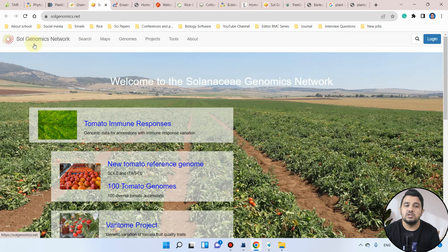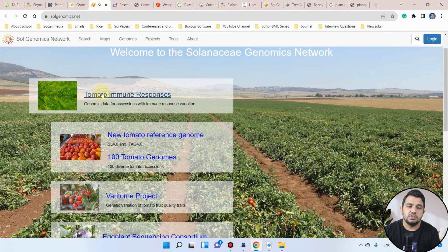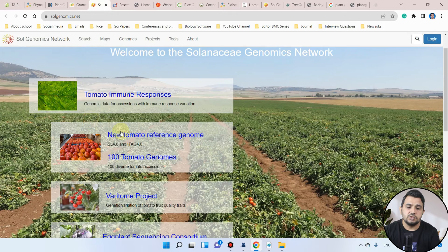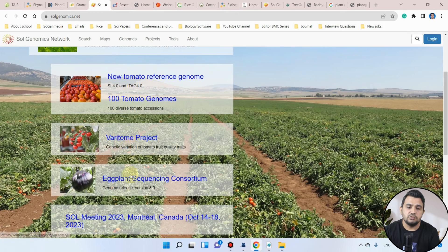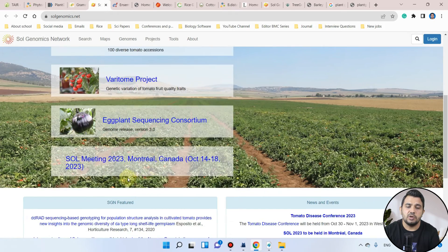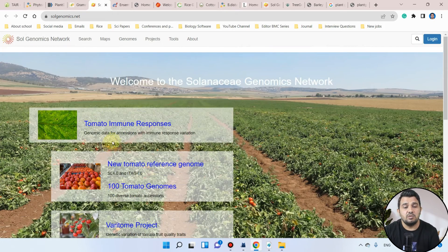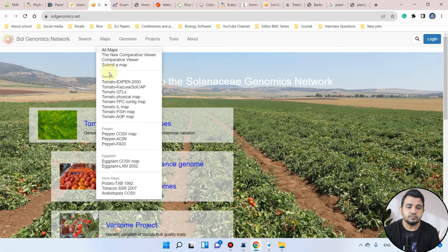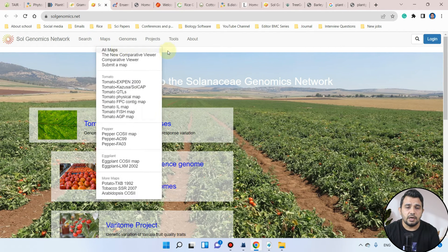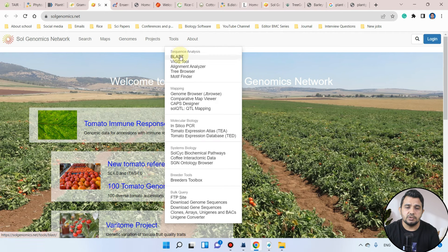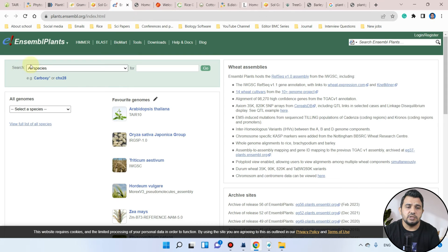The next database is the SOL Genomics Network. Here you can see we have tomato sequences, and for the Veritum project — eggplants and other Solanaceae family members — we can find sequences in this database. We will be using the BLAST function along with a few other tools.